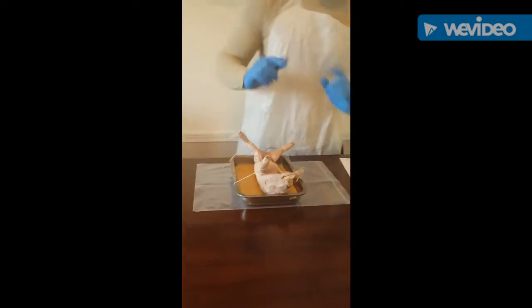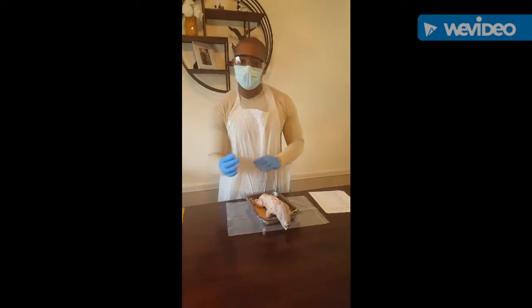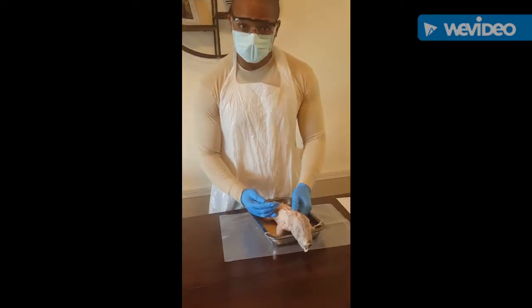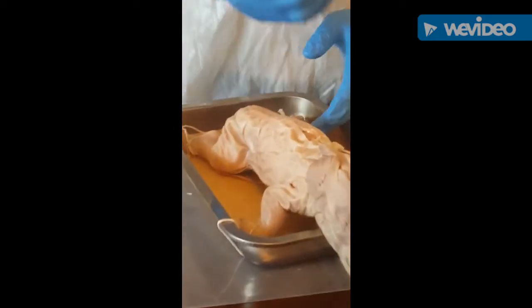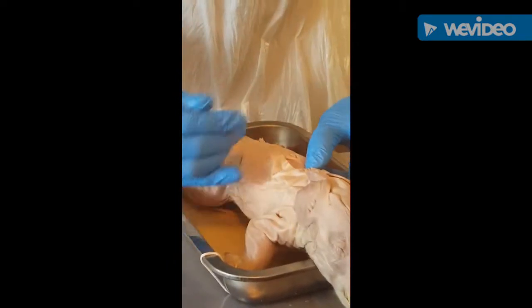All right, so some of the questions we have. So back again, I had to kind of stop the film so I could flip it over and make the incision here. But if you can see here, zoom in a little bit on the spine here. All right, so the next part says, do you notice a covering on the spinal cord? Absolutely. There's a couple of coverings.